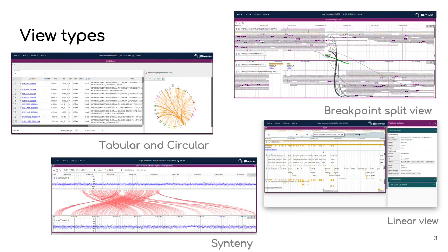One of the most central components to the JBrowse2 infrastructure are views. Views are easily built upon and added to JBrowse2 through the plugin interface. What typically distinguishes a view is a novel representation of data. JBrowse2 has a classic linear genome view but it also has a variety of other robust visual representations of data. Take the circular view which can show translocations between chromosomes and is supplemented in the structural variant inspector with a spreadsheet view that identifies each variant. This view is vastly different in form and function to the Synteny view which can be used to show colinearity between two distinct genomes.